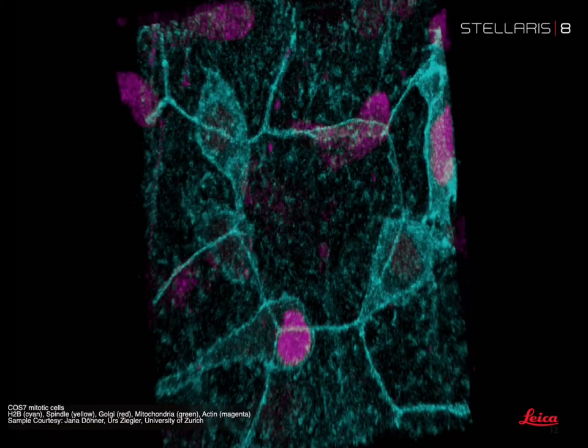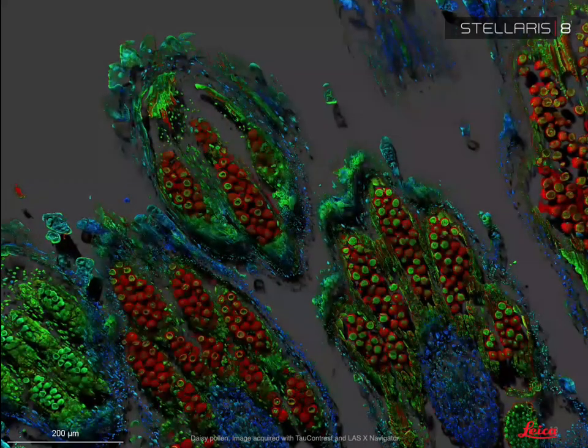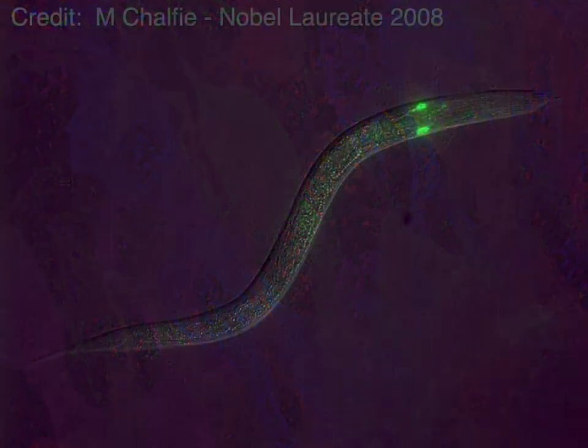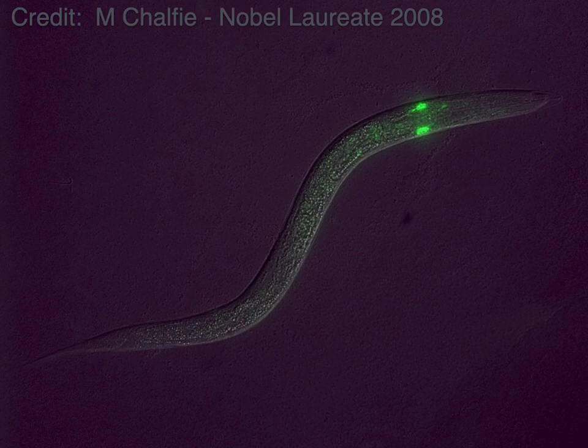Today, we have really a lot of colors we can use with a microscope to communicate what we can see inside. Inside mitotic cells, inside daisy pollen, using colors for bringing to the attention of the observer details that you could lose. These colors in the neurons are related to the mutual distribution and also to the mutual function, not only for aesthetics.